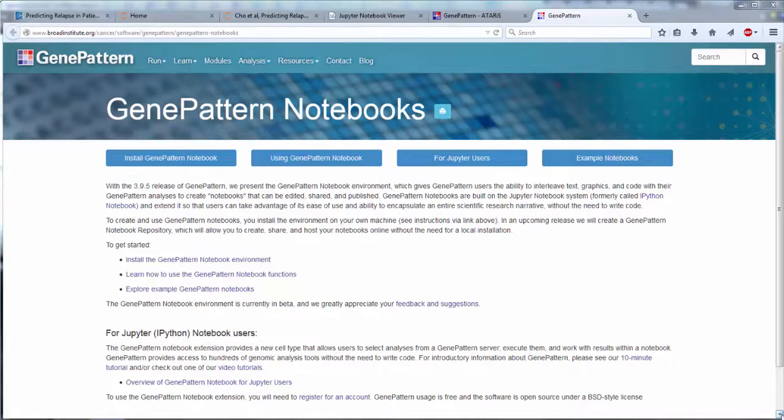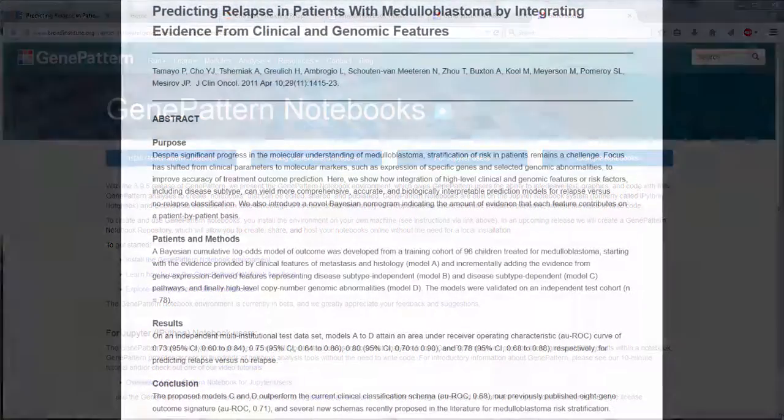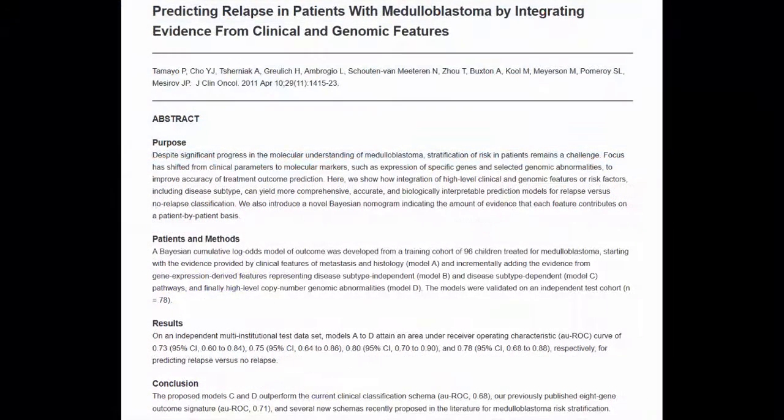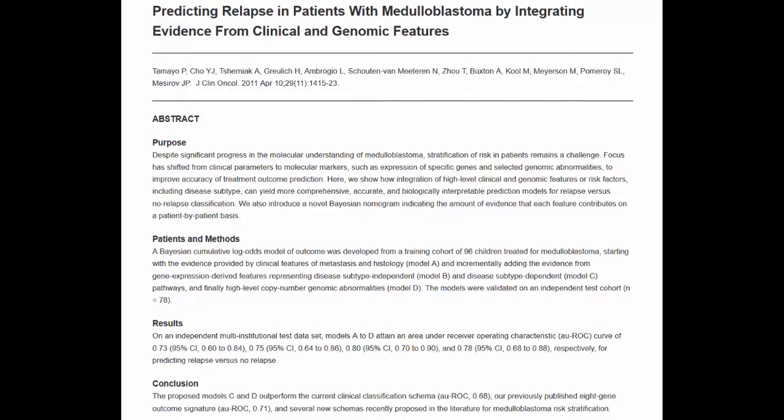To demonstrate, we'll create a new notebook. As an example, we'll use a recent study that aimed to improve outcome prediction for medulloblastoma, the most common pediatric brain tumor, through integrating five clinical and molecular data types via a Bayesian machine learning algorithm.